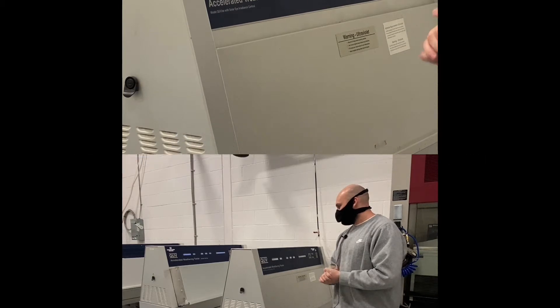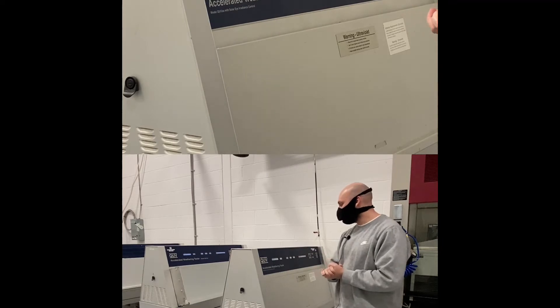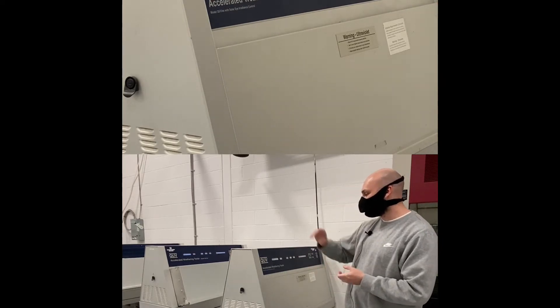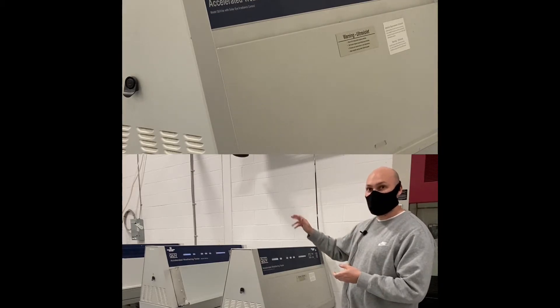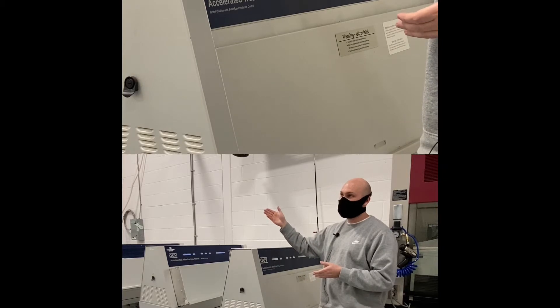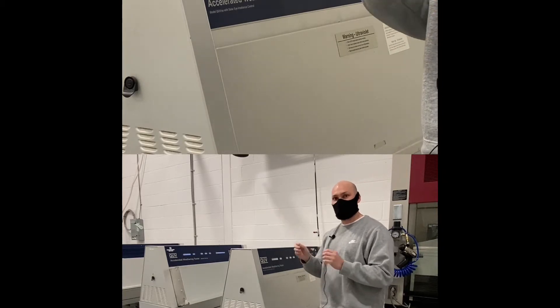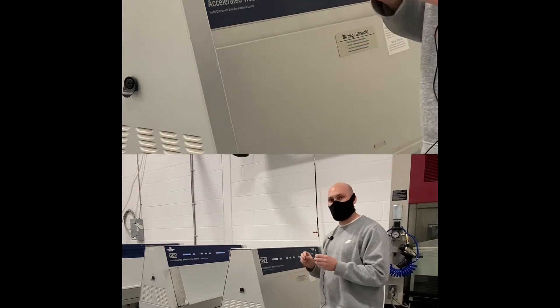This is a fluorescent lamp weathering chamber. It's pretty much like the Xenon arc chamber. The difference is instead of three Xenon arc lamps, you have eight fluorescent lamps. The Q-Sun is usually used more for visible change, while this one is more used for mechanical properties.